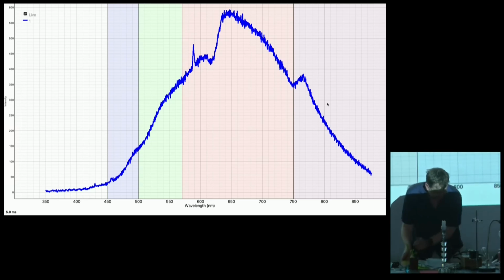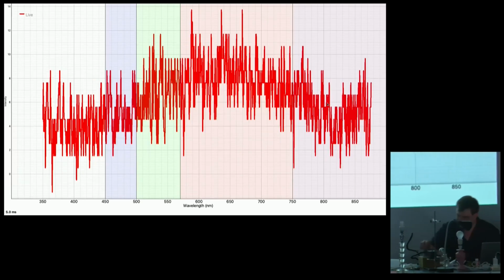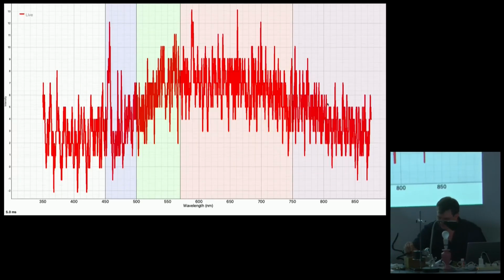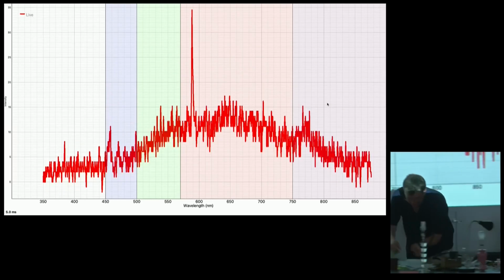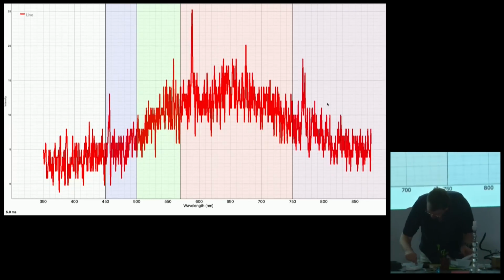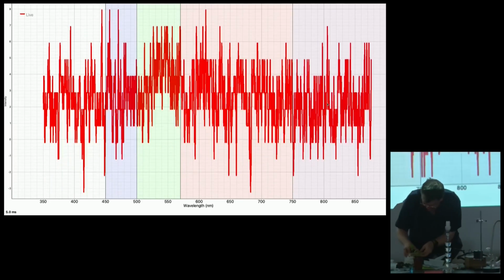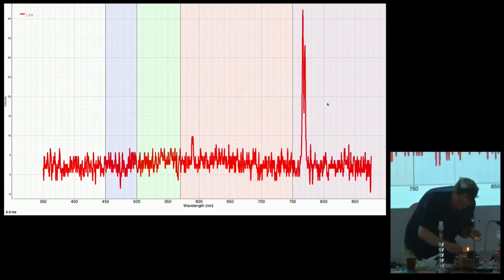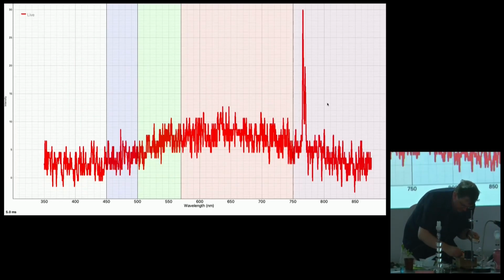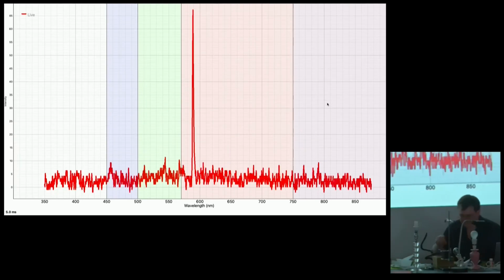Right, let's just let that burn a second, and we'll point this. Nope, okay, that's not working. One last go, and then I will tell you what I was expecting to see. I said this bit was experimental. Right, here we are. Let's just get that pointed there.